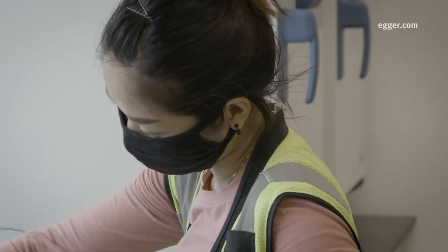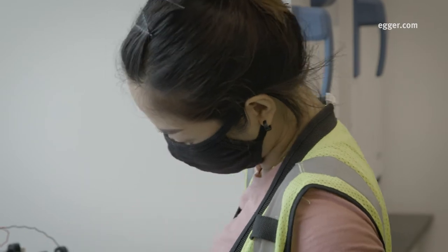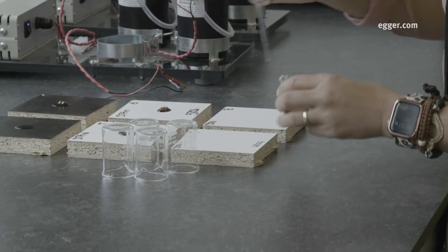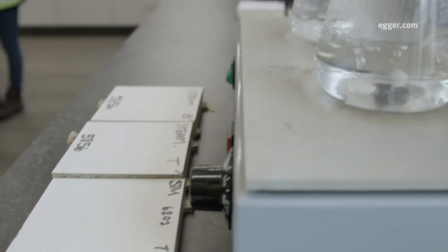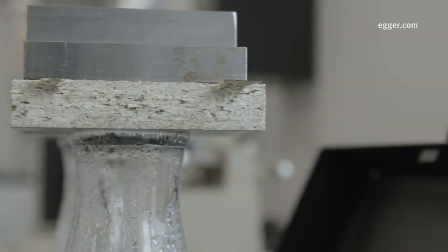A scratch test applies a diamond tip with varied force. The stain test uses coffee or other staining agents. Boards are also subjected to steam and heat to determine their quality.